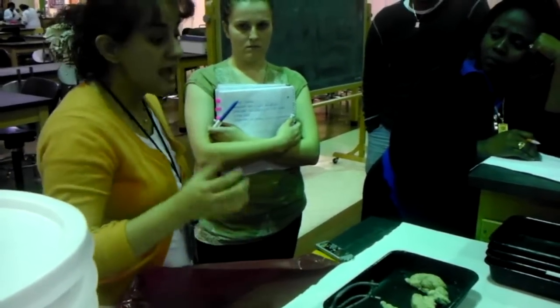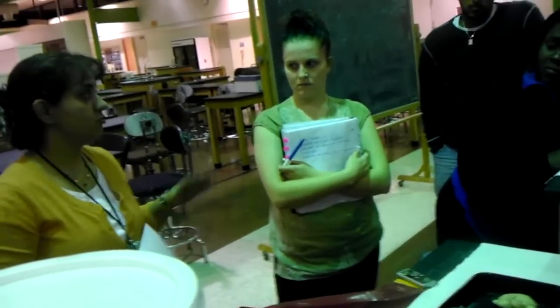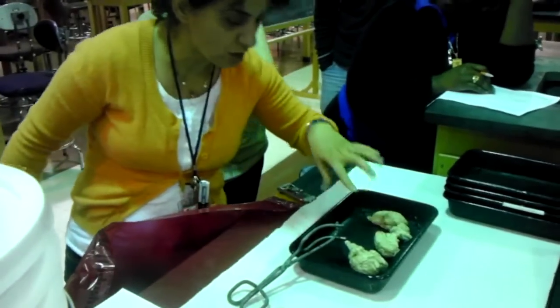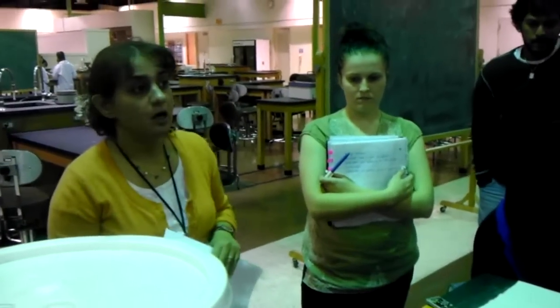In the test you cannot move it because you need the gloves to touch it. So in the test you are not going to move it. You have to distinguish what this part is, what this part is, just by looking at it. So make sure that tonight you will learn it because this is the last chance that you have to learn about the sheep brain dissection.